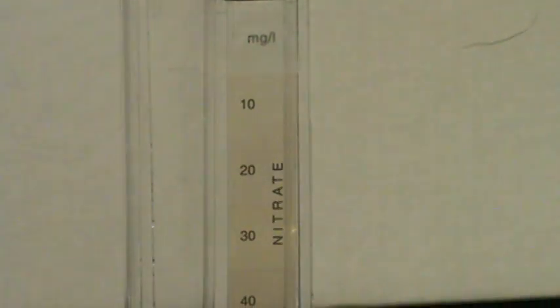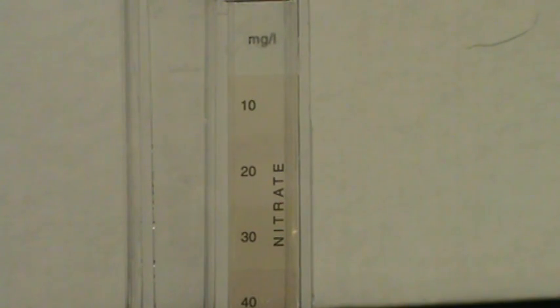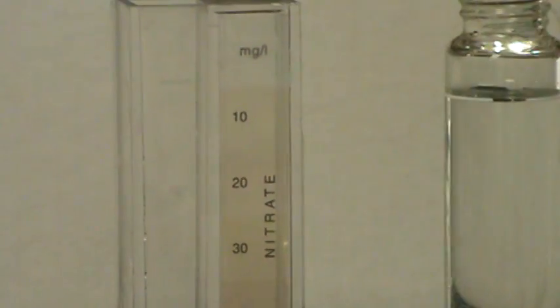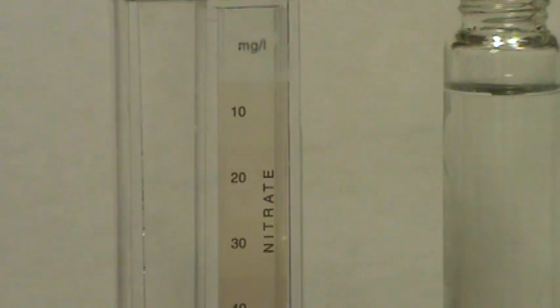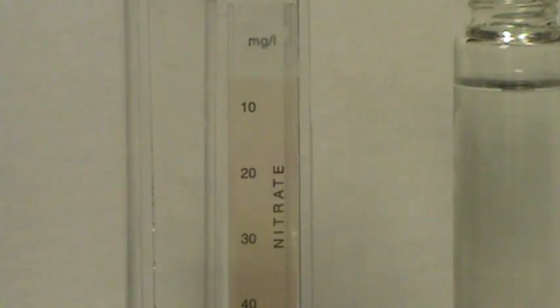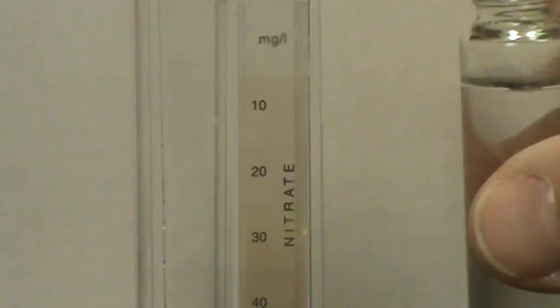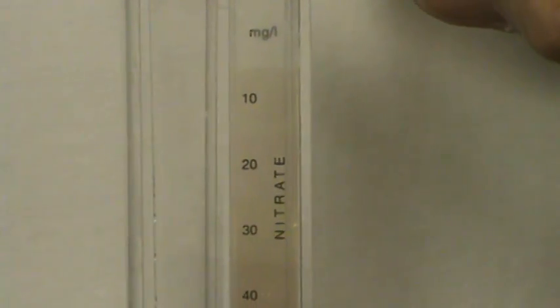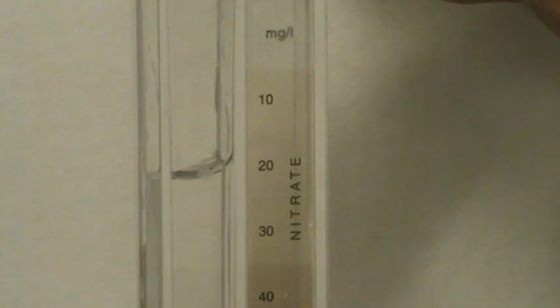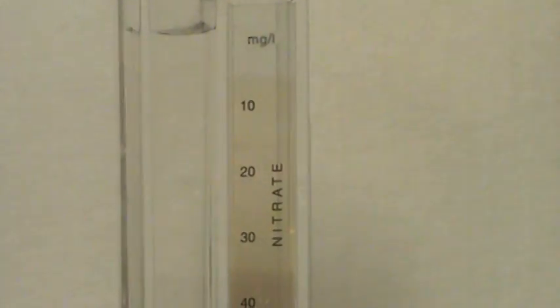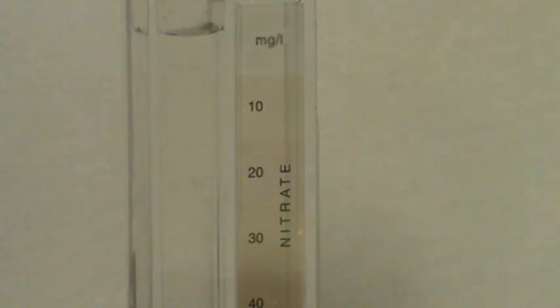We're going to set that aside now that we're done with that. And we've been talking for about four or five minutes. Here's our comparator for the nitrates. I'm going to show you the bottle right here. I see very little color change in this water sample. Now, if our water is clear, that's a slightly blue-tinged plastic, I don't see hardly any. But let's pour it into our comparator. Pour it in our comparator and look. And I don't see it being anything.